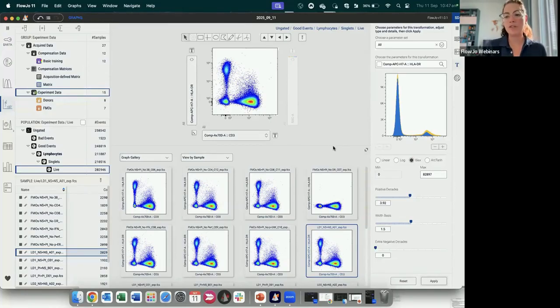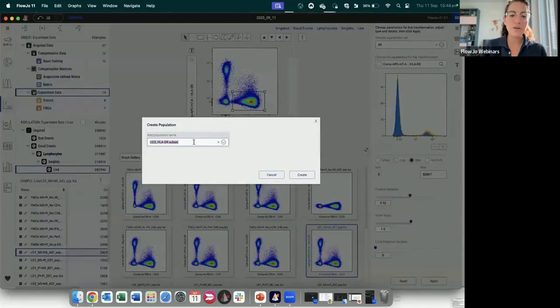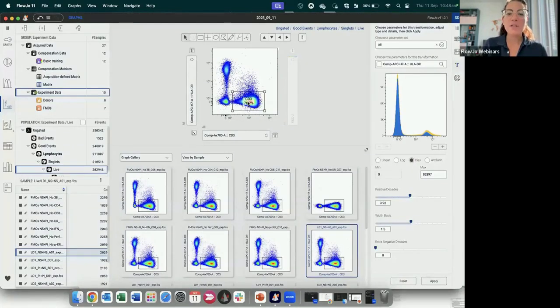That's up to you how you prefer to look at your data, but I personally prefer to look at it this way. So now I can gate on my CD3 cells, and you can choose all the different ways of gating. Sorry if I go by rectangle gate, but it's automatic by now. But you can choose a pencil gate, like this one, or you can choose to use the quad gate or the curly or the spider, the same as we had in V10. Okay, now I finish my gating and I look at the Q&A.